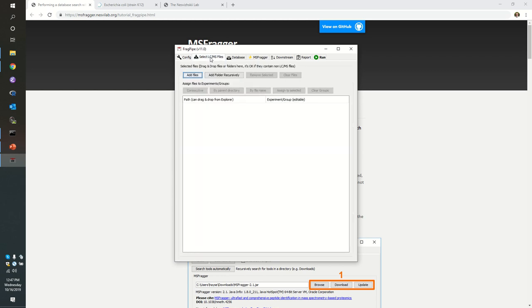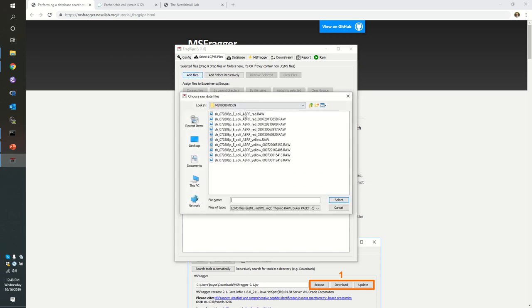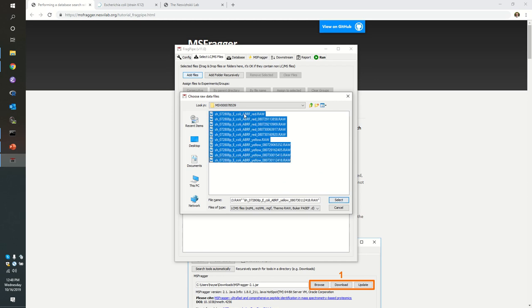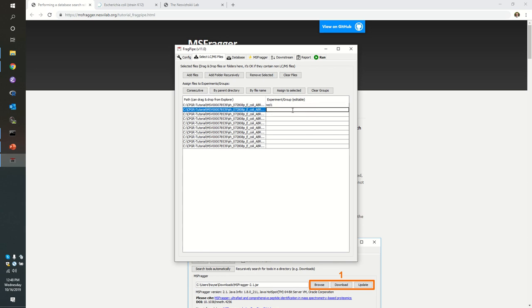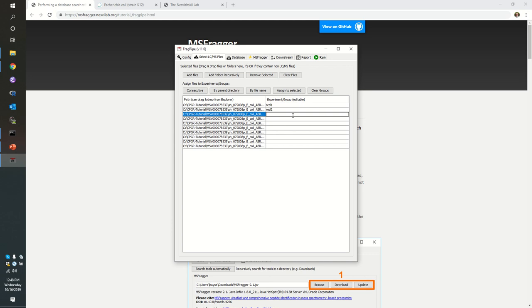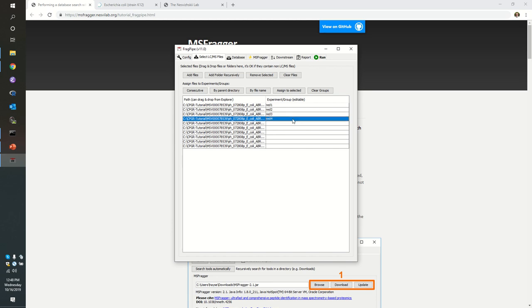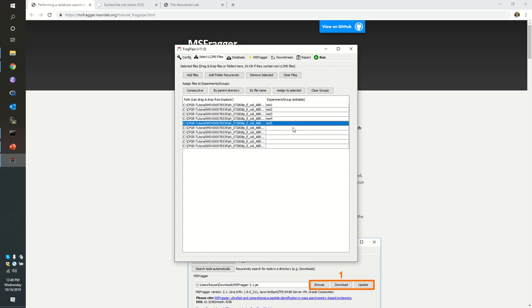We need to select the raw files that we're going to include, and again we can simply say add files and specify that we want these ten raw files all to be searched. Now it's particularly important in this case that we specify the names of these files. We're going to call this one red one and red two. There are ways to have the software automatically pick up labels for you, but in this case we only have these ten files to name.